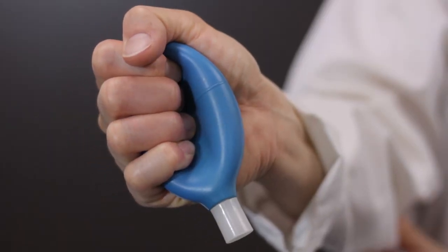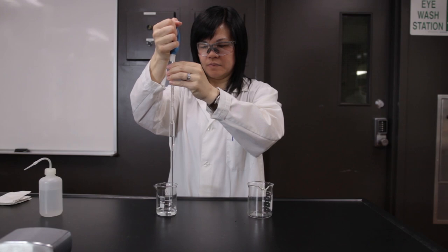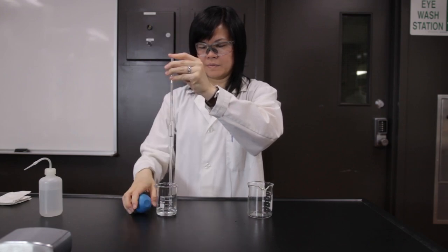Compress the bulb. Place the bulb onto the flat end of the pipette, making sure the bulb is flush with the end to prevent air leaks.